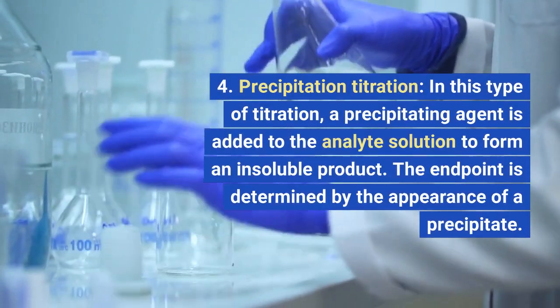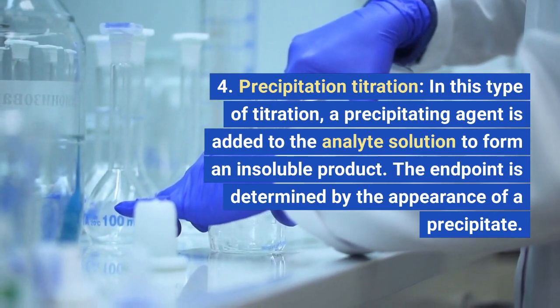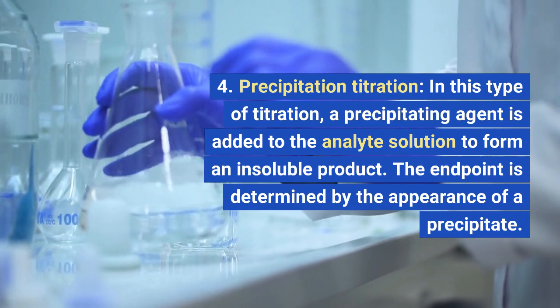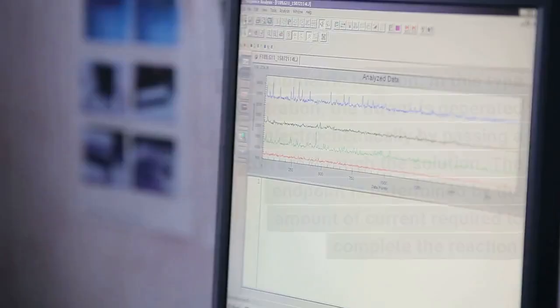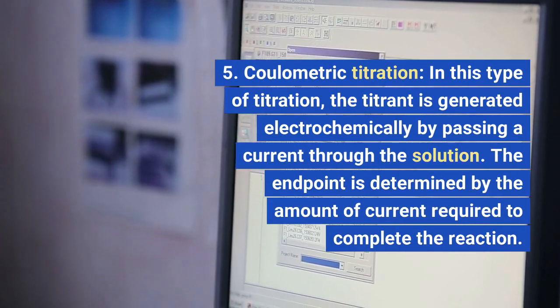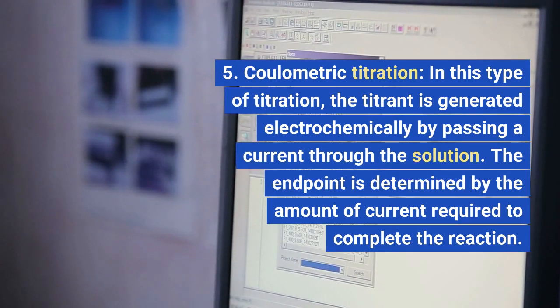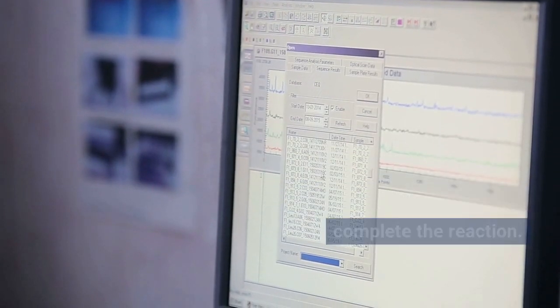4. Precipitation titration. In this type of titration, a precipitating agent is added to the analyte solution to form an insoluble product. The endpoint is determined by the appearance of a precipitate. 5. Coulometric titration. In this type of titration, the titrant is generated electrochemically by passing a current through the solution. The endpoint is determined by the amount of current required to complete the reaction.